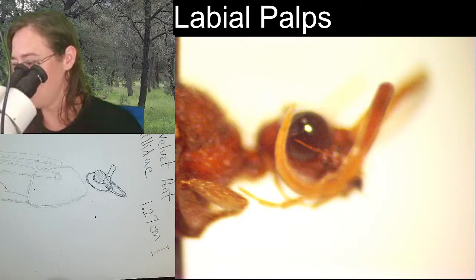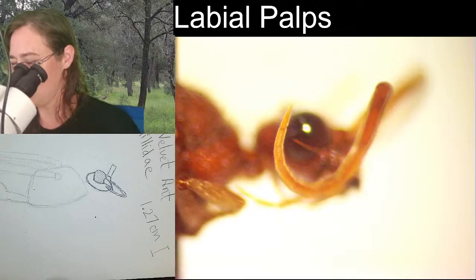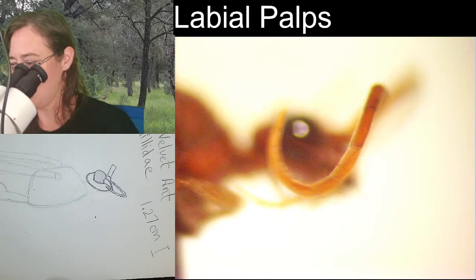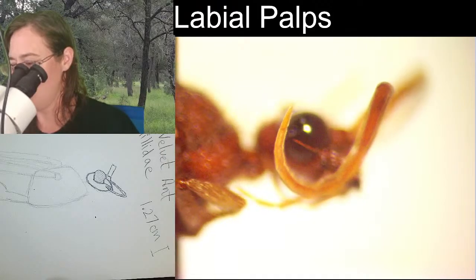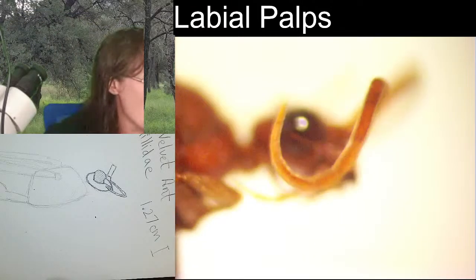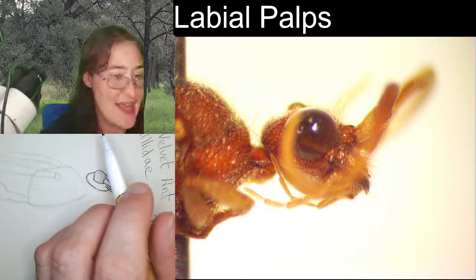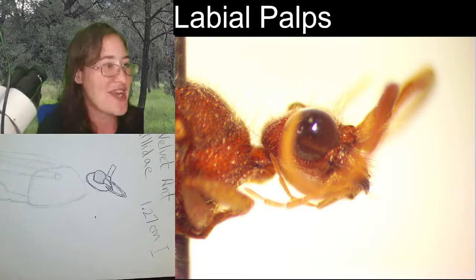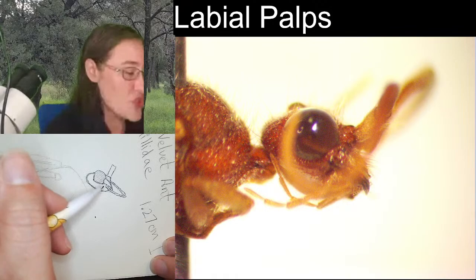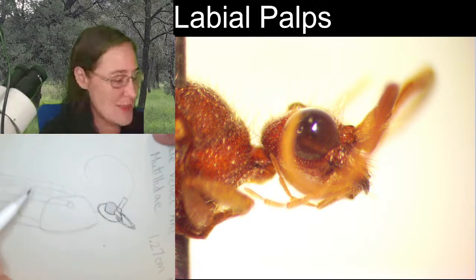So let's see. 1, 2, 3, 4, 5, 6, 7, 8, 9, 10, 11, 12. We're going to count that one more time. All right, I count 12 antennal segments, and that starts here at the base. Our first segment is fairly wide, and these antennae are kind of curly, and velvet ants do tend to have these cute little curly antennae. So instead of curling over the head like this specimen is, I want to curl my antennae this way. I'm going to curl them up.